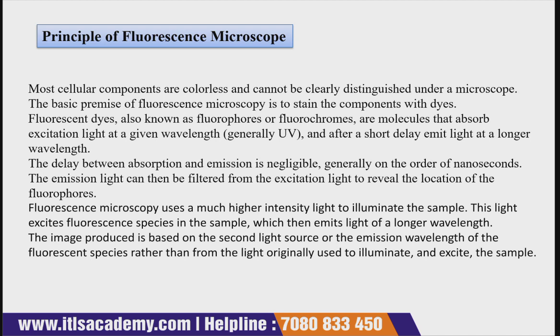So this is very easy: this type of microscope generally uses a dye, or simply a stain component. These dyes are known as fluorescent dyes, also called fluorophores or fluorochromes, and basically they are molecules.